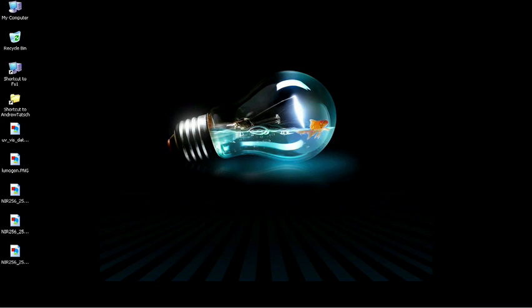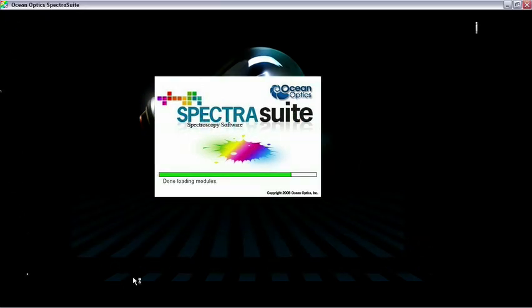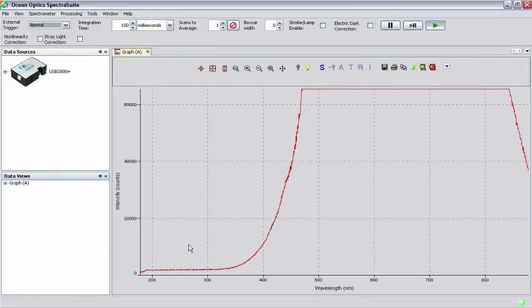Now that the setup is connected, start up the SpectraSuite software. You should be greeted with the SpectraSuite interface showing a picture of your spectrometer in the data sources pane.